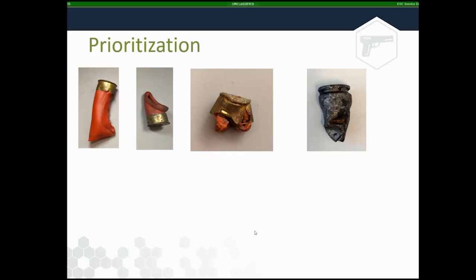Okay. So these are ones that when you see them, you're like, oh man, I don't know. I don't know if my scanner is going to be able to even hold these. I don't know if I'm going to be able to get all the different planes if it's really crooked. So it's just things that you think about whenever you see evidence that looks like this.